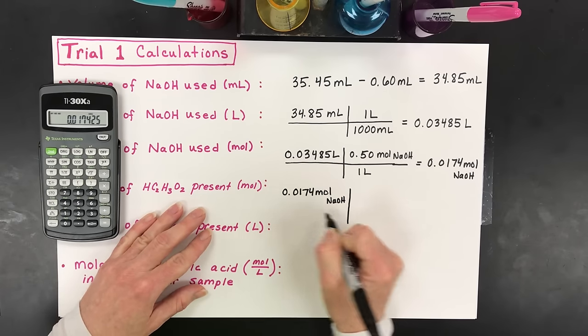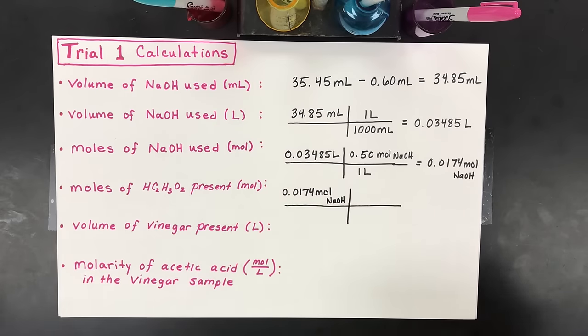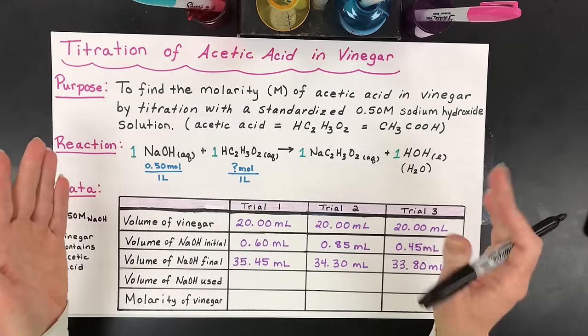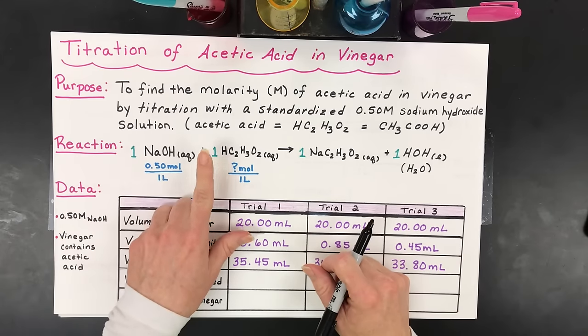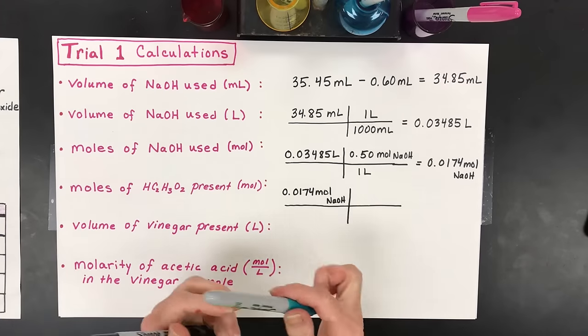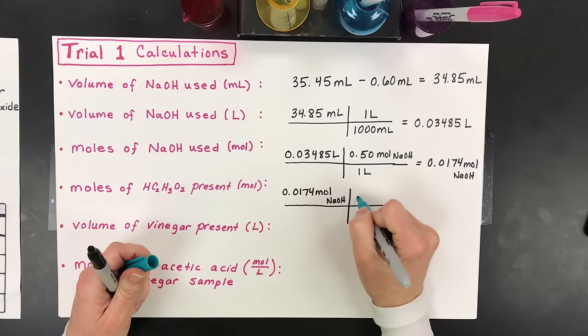And then, because we did a chemical reaction, we have to use what's called a mole ratio. The mole ratio comes off the balanced equation. So right here, we're kind of lucky. They're all one, so they're all one mole of each. So for every one mole of sodium hydroxide, I'm going to neutralize one mole of acetic acid. So I'm going to take those, and those are the mole amounts. I always switch colors. There's one mole to one mole.